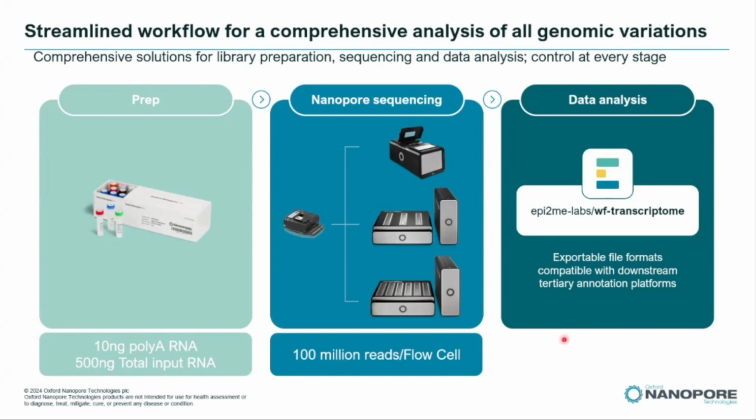Then we are going to go into the analysis, and we offer an analysis workflow called WF Transcriptome on our EPI2ME platform. The files that are generated by EPI2ME WF Transcriptome are compatible with third-party analysis tools if you want to refine your analysis.